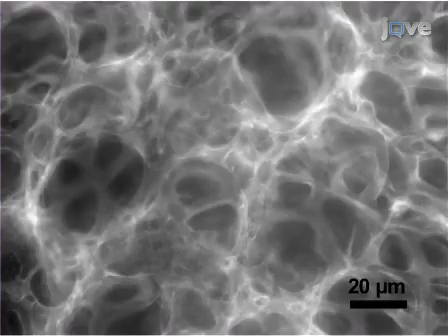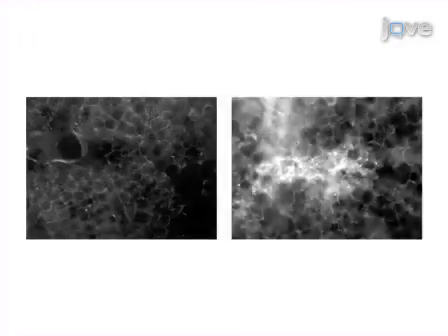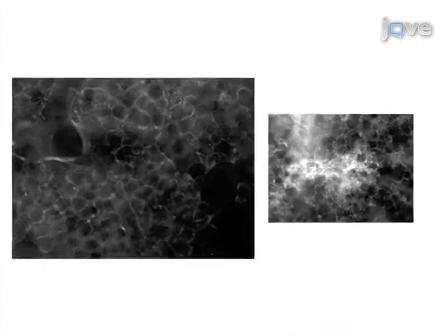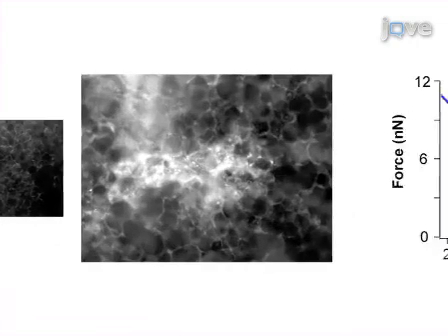This figure shows that in properly cut and stained tissue, the alveolar microarchitecture of lung parenchyma is well preserved, as observed by immunofluorescence staining for the basement membrane component laminin, without fixation or permeabilization. These panels show immunofluorescence staining for collagen 1 in fresh, unfixed lungs harvested from mice previously treated with PBS or treated with bleomycin to induce fibrosis.